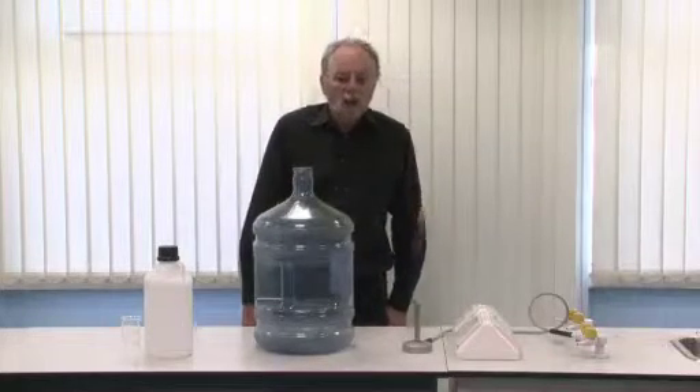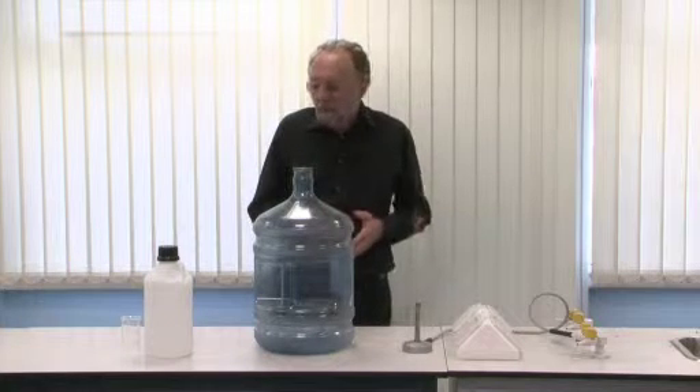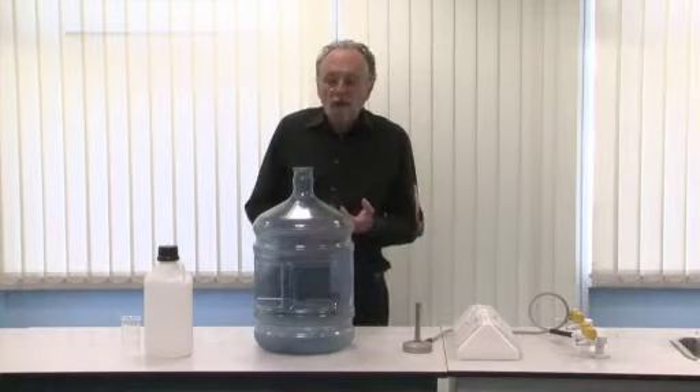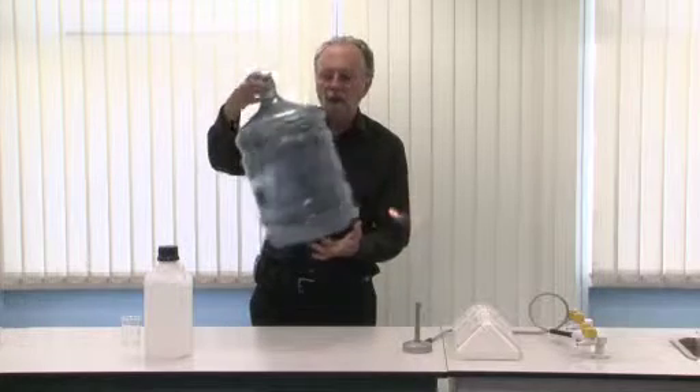In this short guide I want to talk about an interesting demonstration using flammable vapour. I'll be using propan-2-ol, but pretty much any other alcohol can be used. All you need for it is the 20 litre bottle that's normally found on a water cooler.